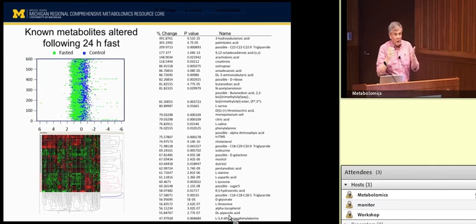One of the things we're going to start working through is correlating the lipidomics with the untargeted metabolomics and seeing exactly how these things correlate. It's part of the project that Al is working on, to use these different platforms to seed and cross-identify the, quote, unknowns in each platform.